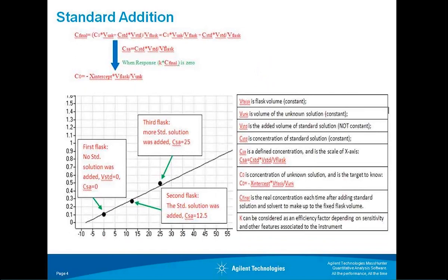Here are some equations, but I'm going to try to give a blue-collar explanation. If you look at this calibration curve, if you excuse me calling it that, you'll see that the original sample here is at 0. Then we've added a spike, which gives us a greater response. So it's the area of the unknown plus the area of the first spike, and then very similarly, the area of another spike. And you get this line that has a slope.